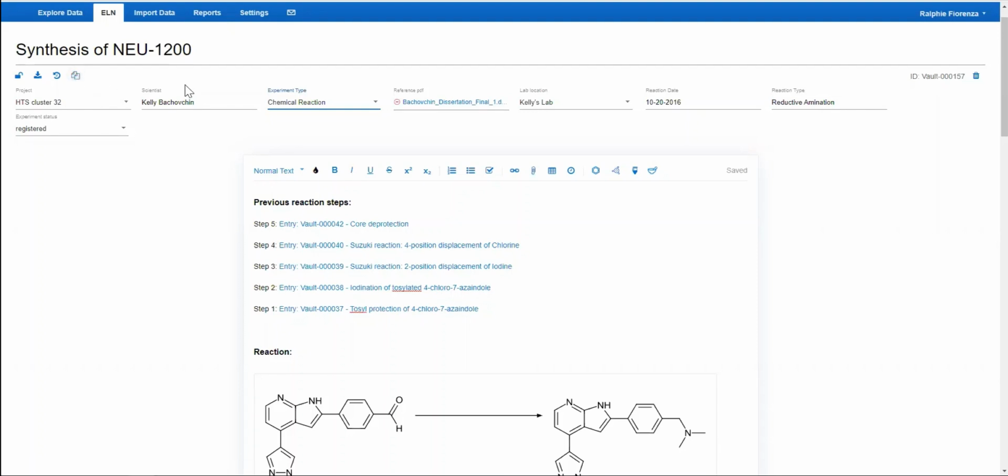In addition, you can set up as many configurable user-defined metadata fields as you'd like within the ELN, and these can contain information such as text and numbers, controlled vocabulary pick lists, file attachments, and date fields. The purpose of these fields is to allow you to more easily sort through your complex entries.